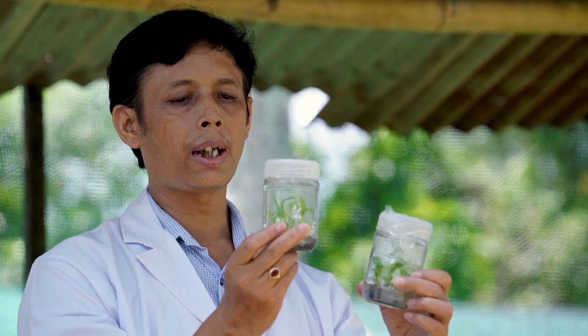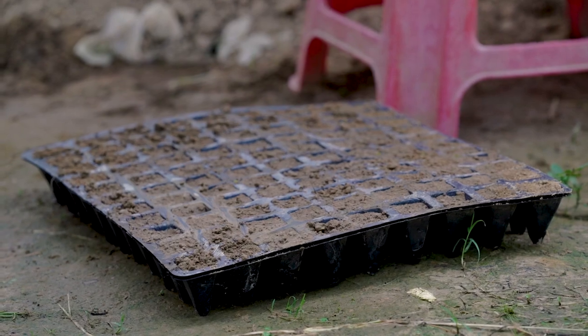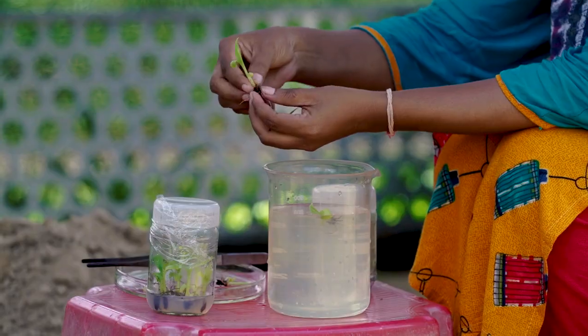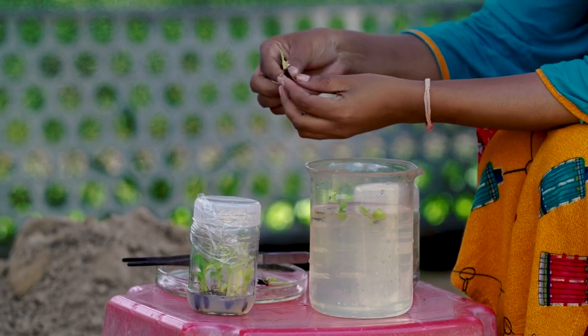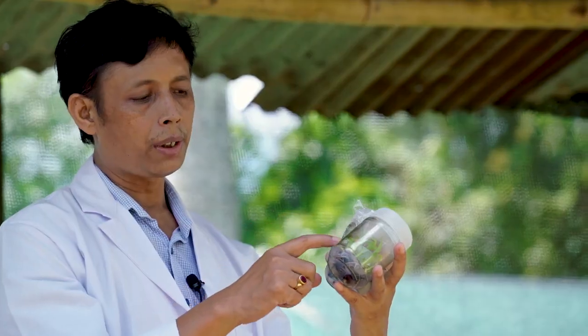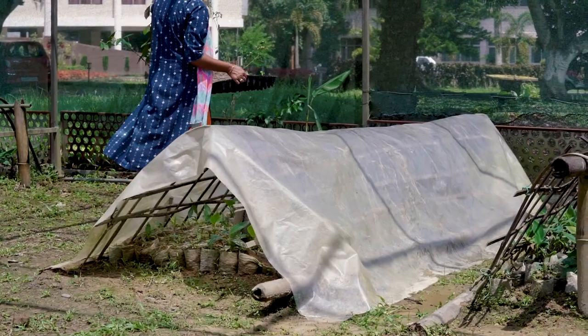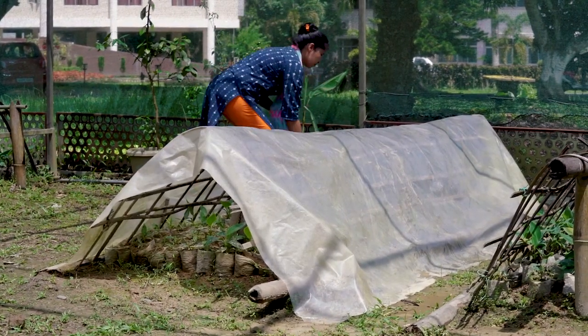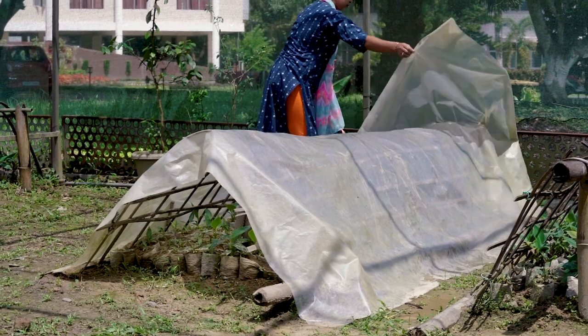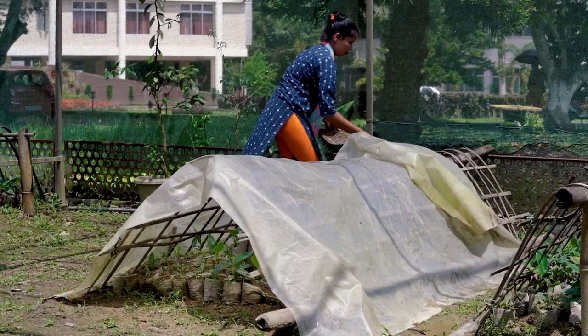Primary hardening is carried out in cocopeat trays, where we use cocopeat as a potting mixture. Once we take the plants out of the glass jar, they are washed with water so that no media remains on the plants. Then these are transferred into cocopeat trays, and these trays are kept in the polytunnels for 15 to 20 days so that the plants become acclimatized to the normal environmental conditions.